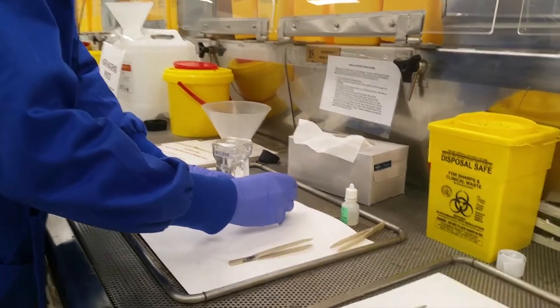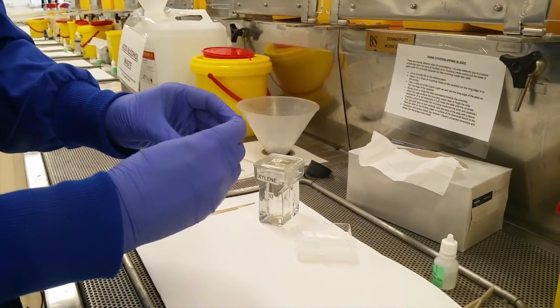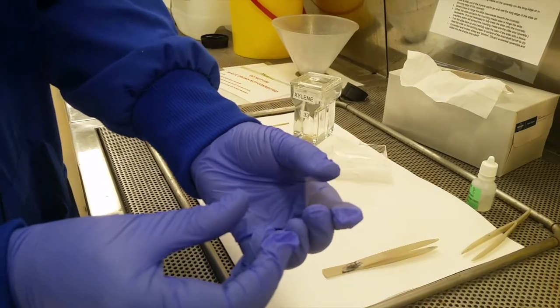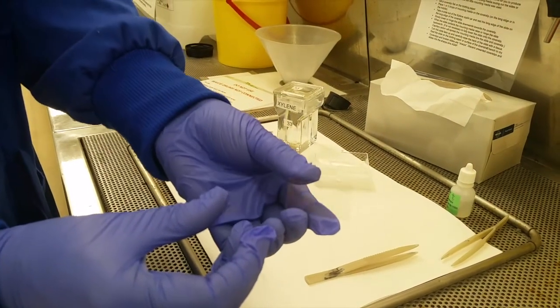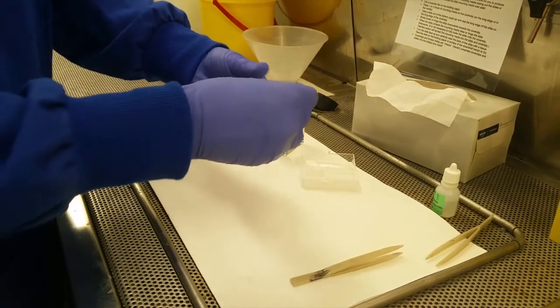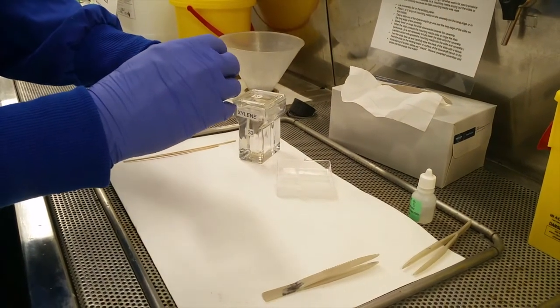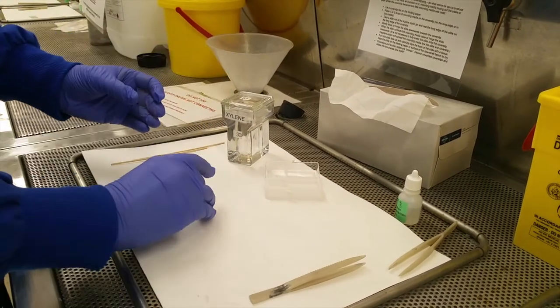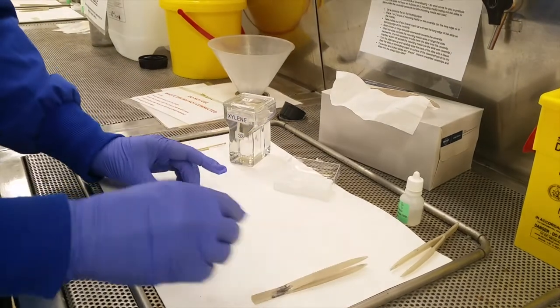So here I am just checking to see that I've only got one cover slip, and actually I can just make out there's a few stuck together. The camera doesn't quite pick it up, but I've noticed that there's a couple stuck together, and sometimes you get a diffraction grating visible to the naked eye. So I just need to separate those out so that there's only just one. And in fact, I think there might have been three that were stuck together on that occasion. There we go. So I've got my one cover slip ready to go.